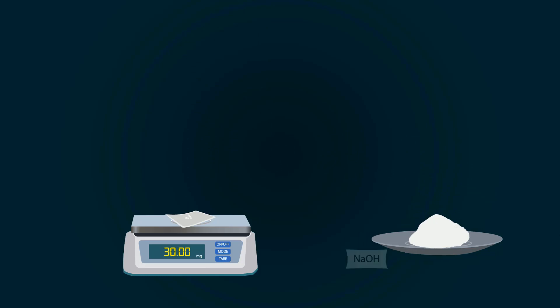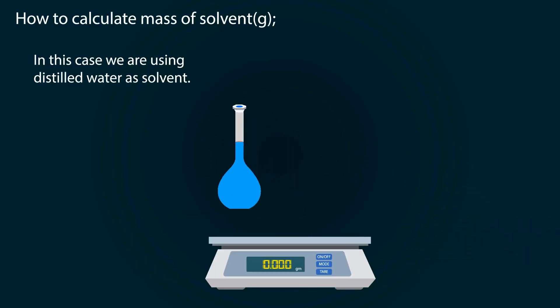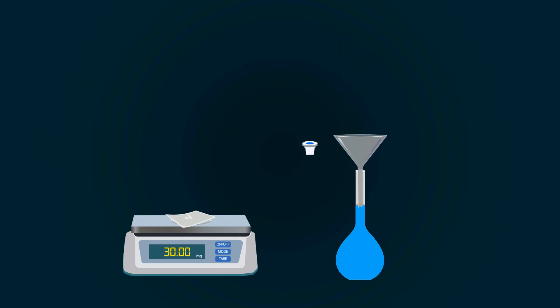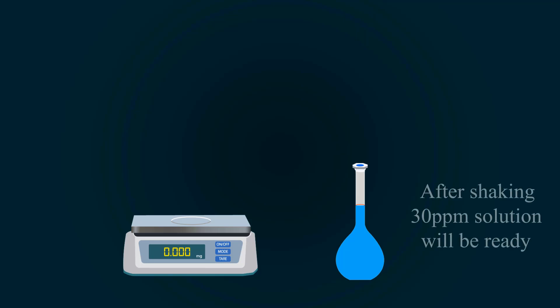Now put this 30 mg into the volumetric flask which contains distilled water. Please add the solute with the help of a funnel. After adding, close the volumetric flask and shake it well. After shaking, you will get 30 ppm solution of any solute.